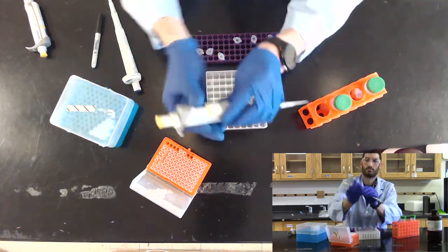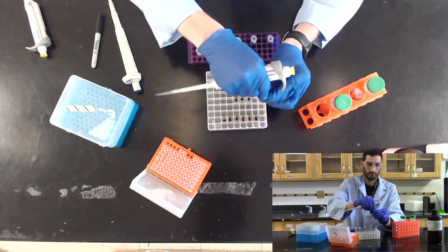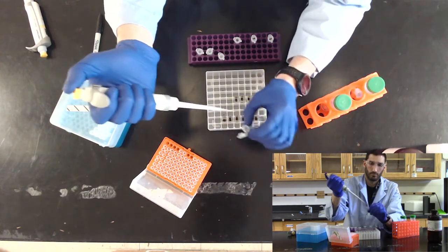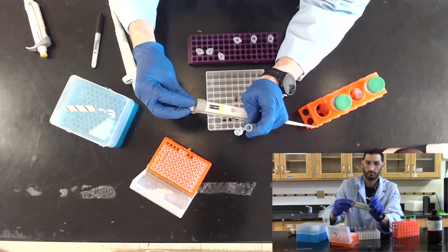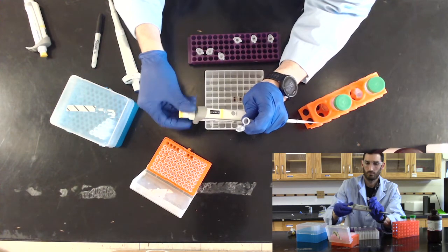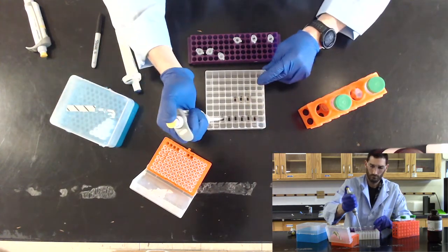Next, add 4 microliters of a 2 mg per mL BSA solution to cuvette number 2. Continue to add your protein standards in 4 microliter increments to each of the remaining cuvettes. For your last cuvette, we should expect to add 20 microliters of a 2 mg per mL BSA standard.